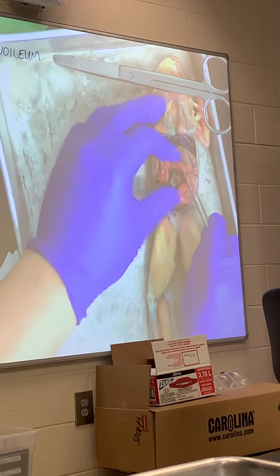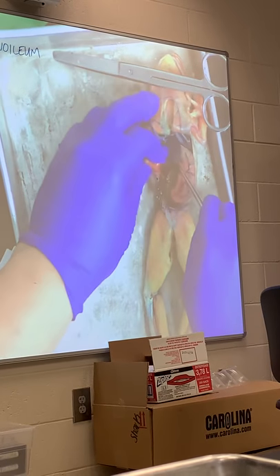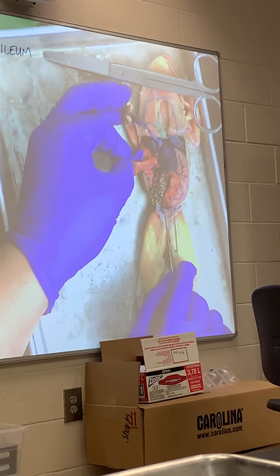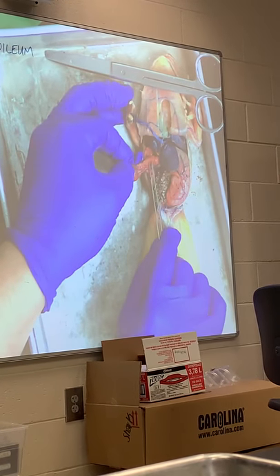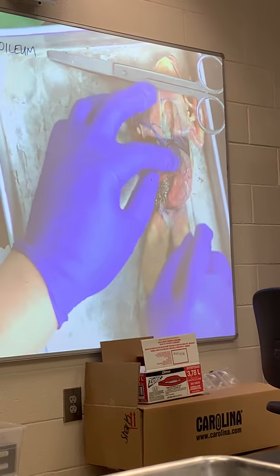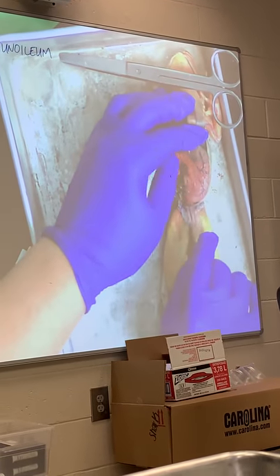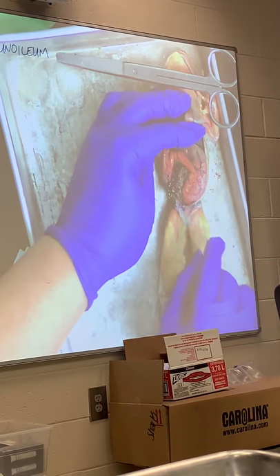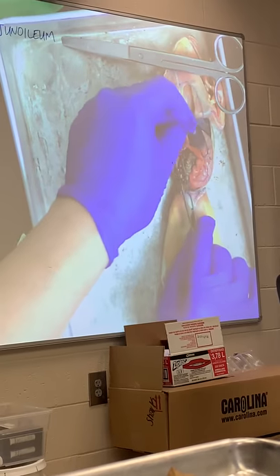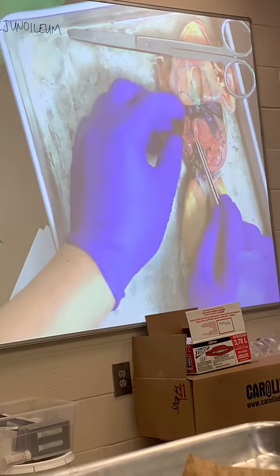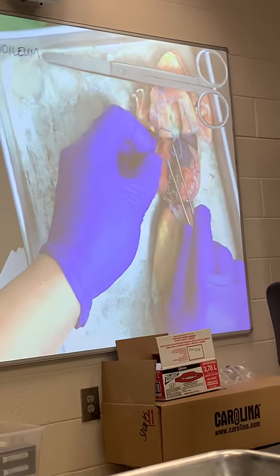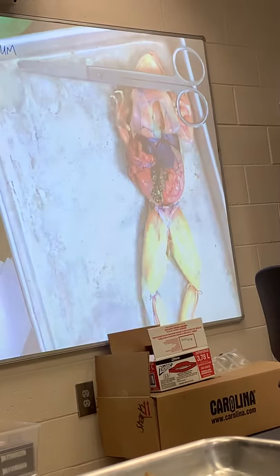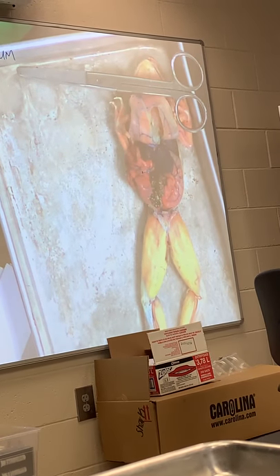Now you have to kind of unravel all of the intestines. But what you'll see is that the duodenum continues kind of straight from the pyloric sphincter all the way across. That first part of the small intestine is connected to the stomach by the greater omentum. When the intestine turns, it becomes super curly — I'm going to kind of peel it out of my frog here. When it becomes super curly and it's connected by this mesentery here, it becomes the later two-thirds of the small intestine.